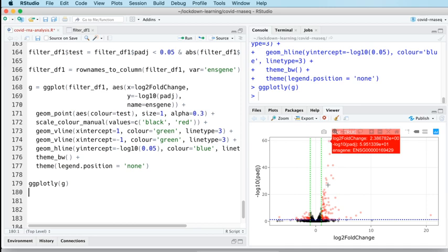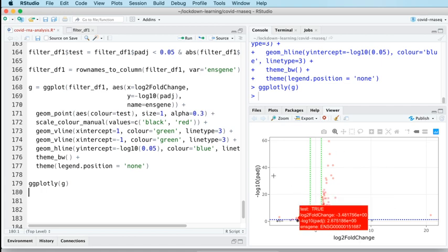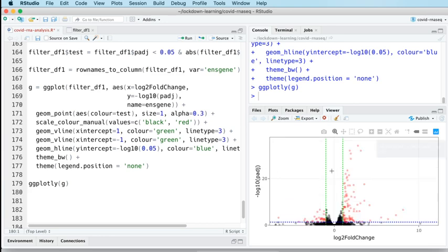But I think it's possible to zoom, so you can interactively zoom the canvas here. So rather than having to set your limits, you can define them. There you go. I dragged a little box and it zoomed me in to a closer bit of the plot. I haven't removed any data this time, in order to be able to zoom in to see a slightly more legible volcano plot than the fully zoomed out version of all of the data.